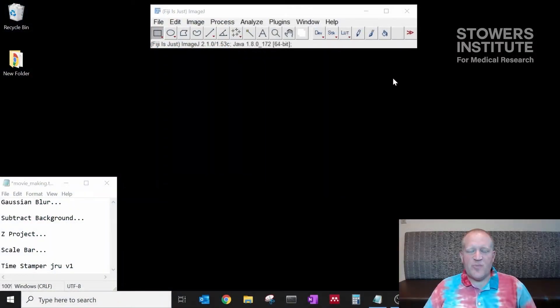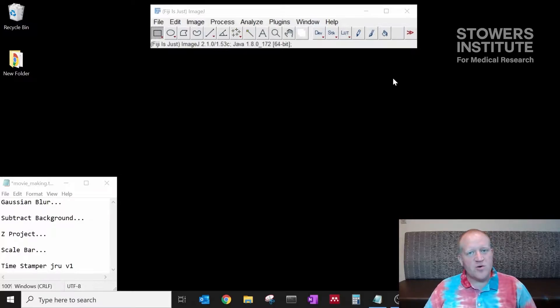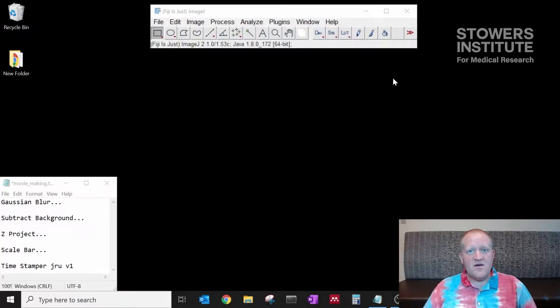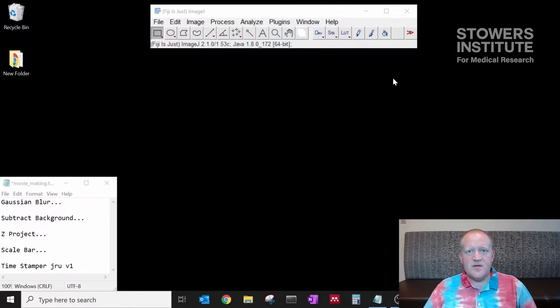Welcome back everyone to part six of our Fiji tutorial videos. Today we're going to be covering how to make a movie out of your data set that includes a timestamp and a scale bar.